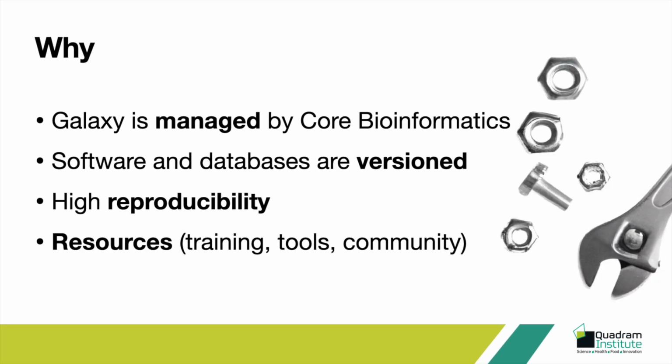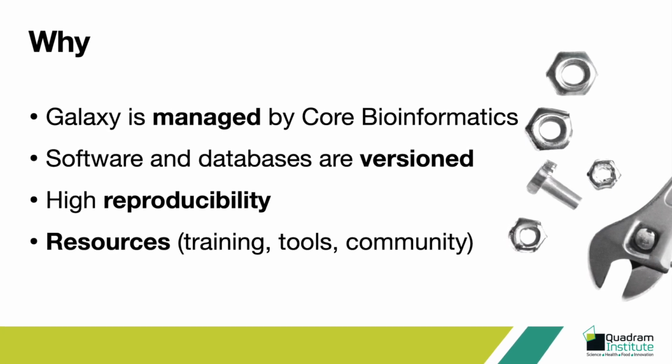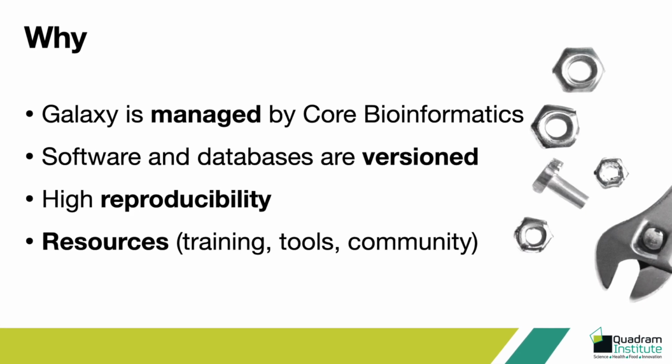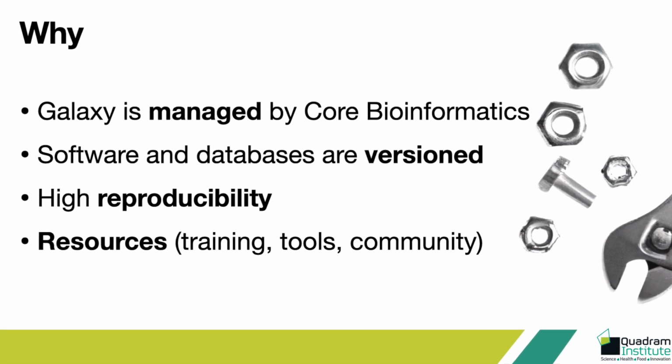If you decide to use Galaxy for your bioinformatics analysis, you will use a service that is managed by Core Bioinformatics. All the software and databases are versioned, and this ensures a high reproducibility of your analysis. Moreover, you will join a community of thousands of researchers, and you will find a lot of training material online.